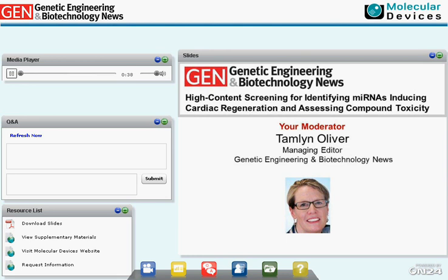The three speakers in this webinar will discuss how high content screening can be used to assess microRNA-induced neonatal cardiomyocyte proliferation in vitro, how it can be applied to evaluate restorative properties of microRNA after myocardial infarction in vivo, and also how it can be applied to cardiac safety testing of pharmacologic compounds.